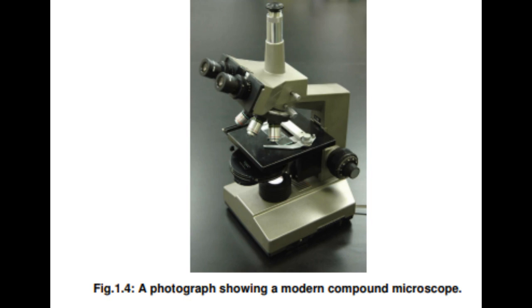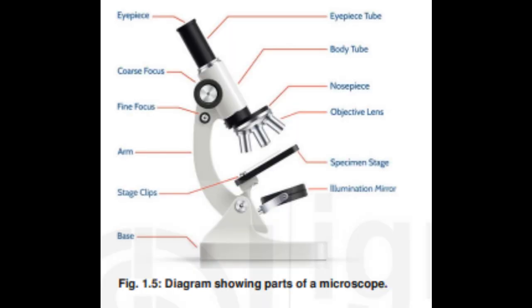In the first type of objective, the refractive index, RI, of the oil matches that of the glass. The focal length regulates the optics of the objective. The focal length is inversely proportional to the magnification. This means that the focal length of an objective decreases with the increase in magnifying power. In some objectives, special glasses are used. These are called apochromats and were first produced commercially by Abbé in the 1870s.